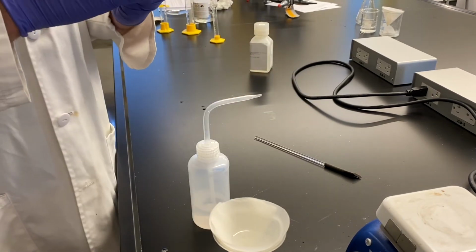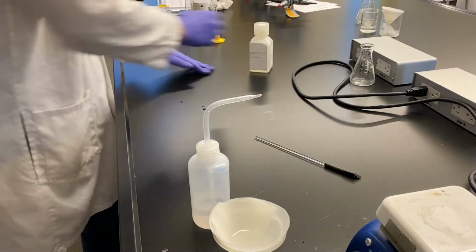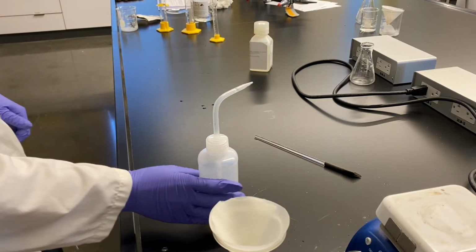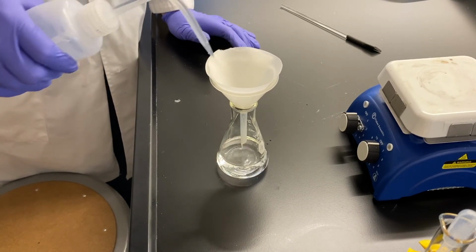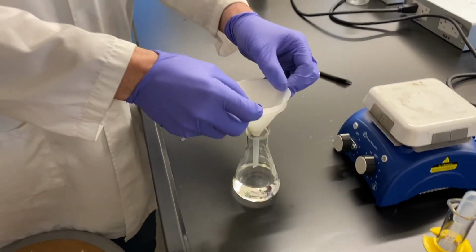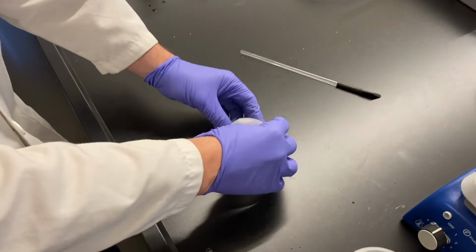So we're just making absolutely sure we got rid of all that. Well, not rid of, but washed all the calcium carbonate in. We'll let it slowly go down. And you can see the liquid level dropping through the filter. This is sped up, of course. We'll wash it a little bit because we don't want any sodium carbonate that happened to be left over to be on there. So we'll wash it off with water because we just want the mass of that calcium carbonate.